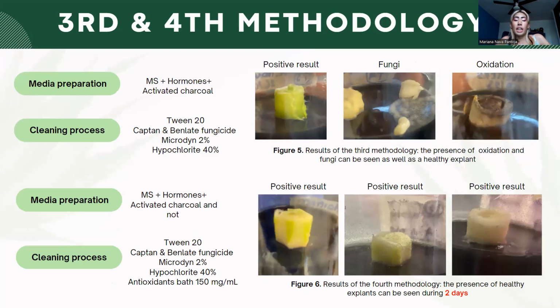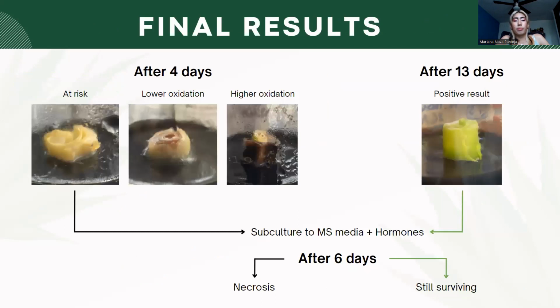On the third methodology, we had fungi as well as oxidation, but we had one positive result, one healthy explant that had shoot formation. For the fourth methodology, we had no contamination at all, but the explants remained healthy only for 2 days, after which they began oxidation also.